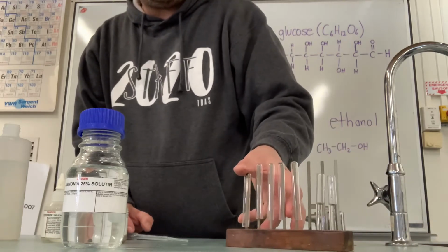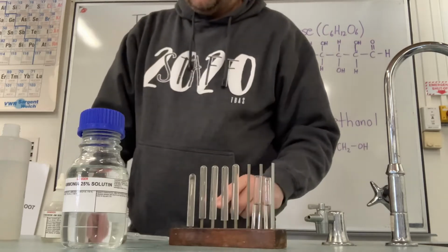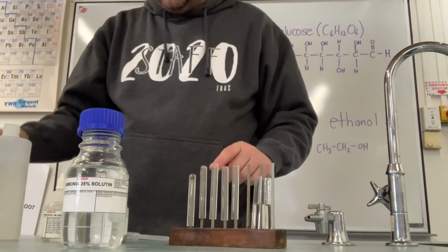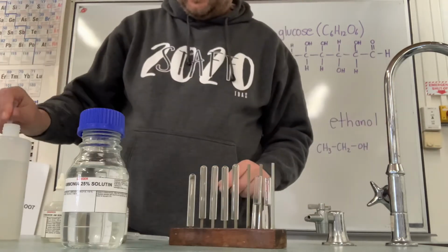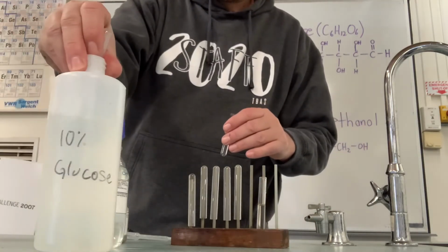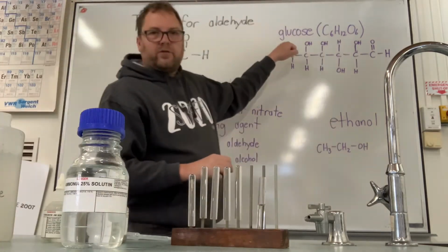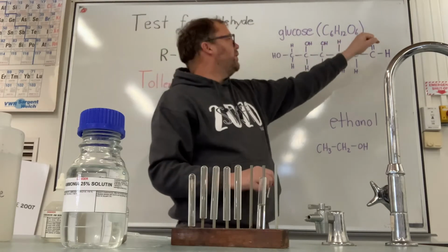Sorry, you can't quite see those, just here in the end. So what we are going to do is to one of those test tubes, we'll do it to this one here, we are going to add some glucose solution. So 10% glucose solution. So we've got our glucose structure up here. We all know probably glucose, C6H12O6.